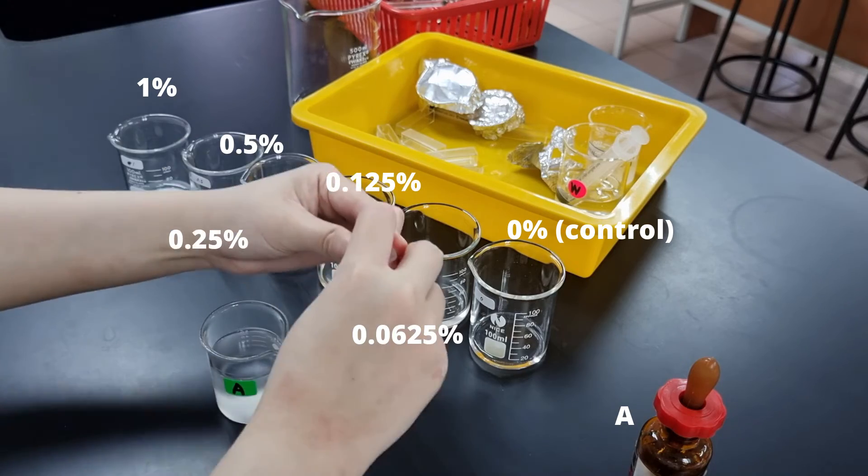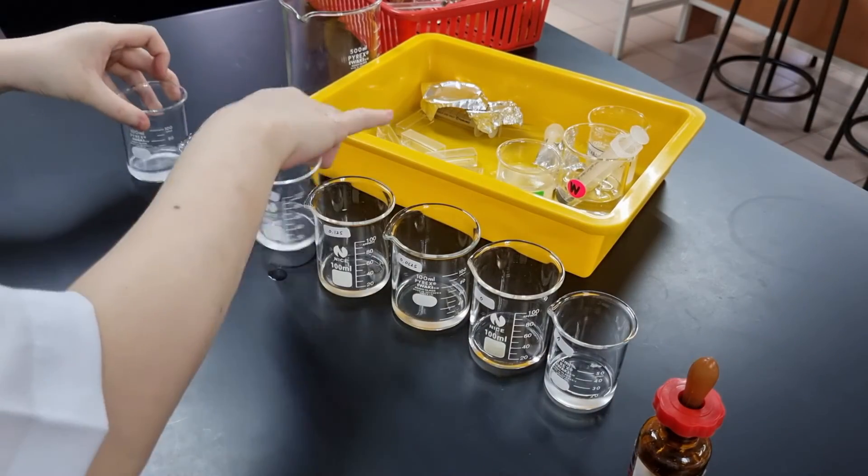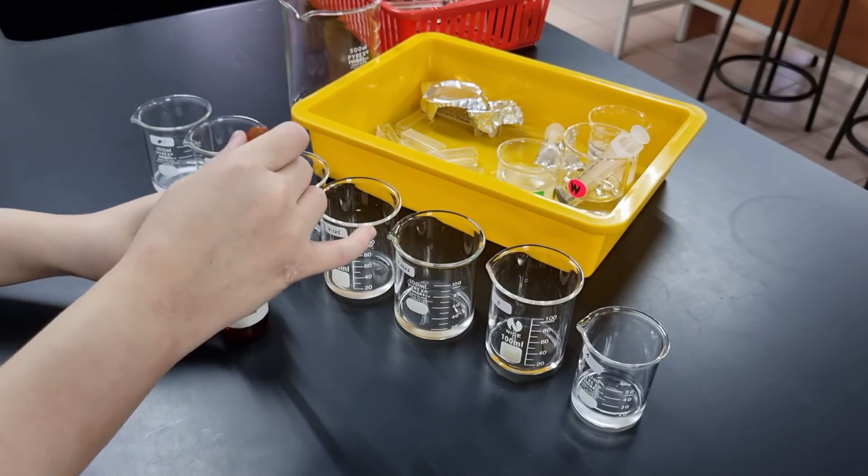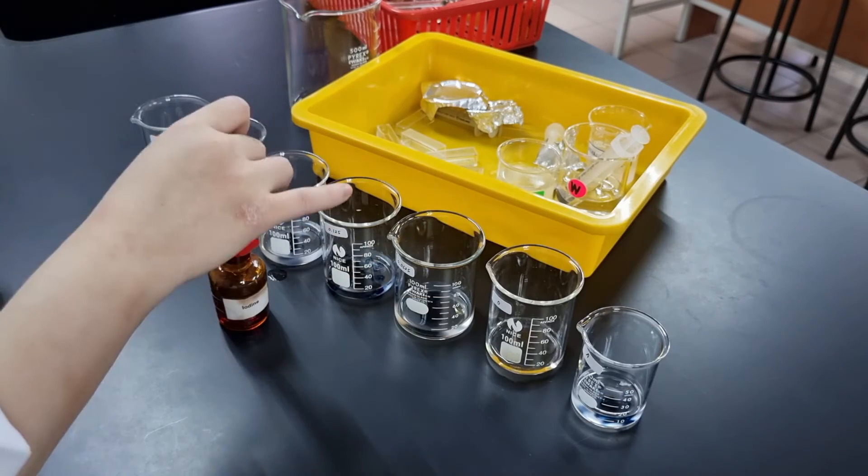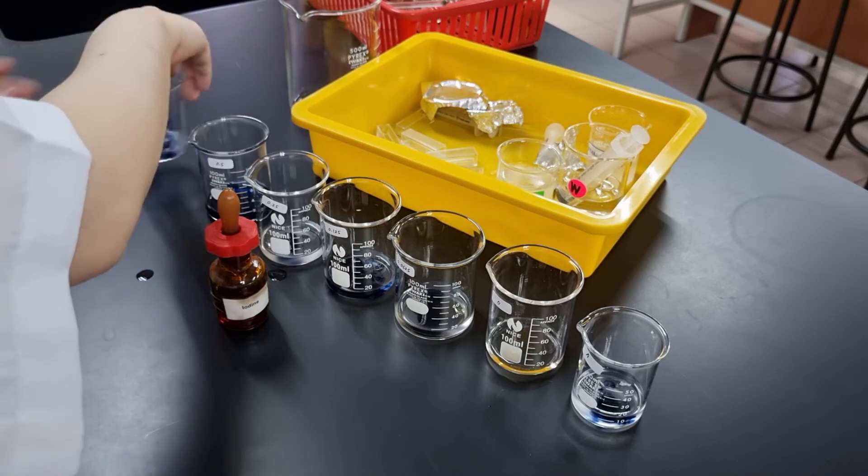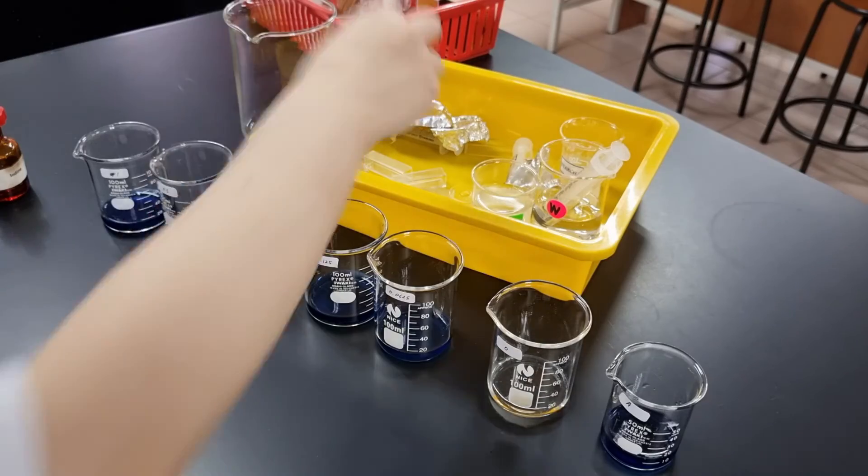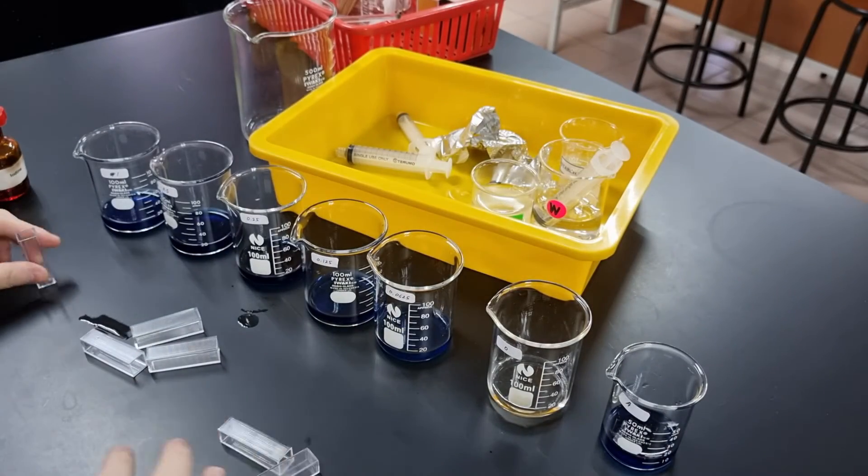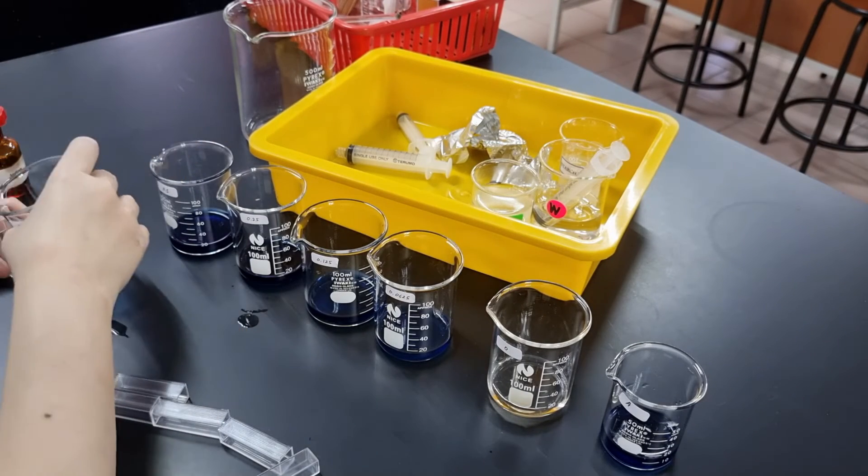Then this is me adding 10 cm³ of solution A into the seventh beaker. Shake it a little bit just in case, and then add one or two drops of iodine solution into the beakers. Making sure that your drop size is about the same, this is why I added a little bit extra at first, because I added too much in the previous beakers. So I'm trying to make sure that iodine solution drop would be about the same amount in each beaker.